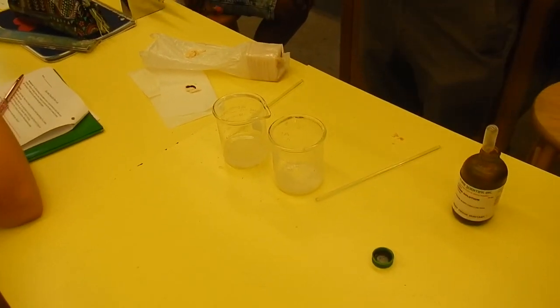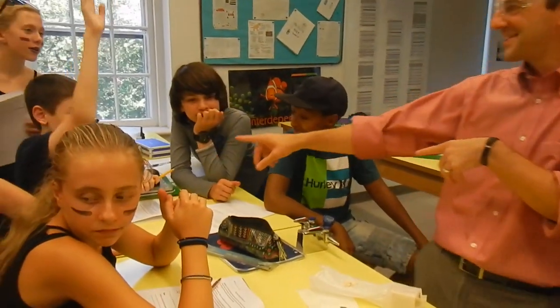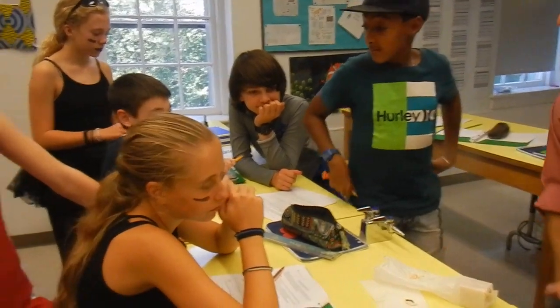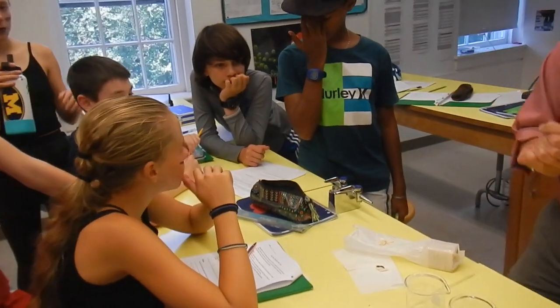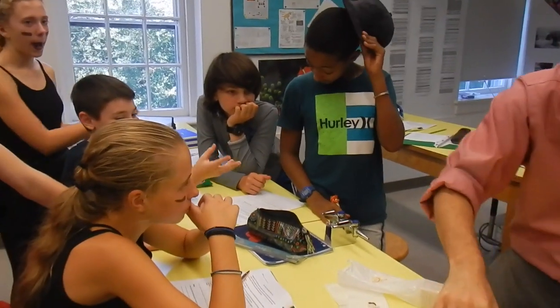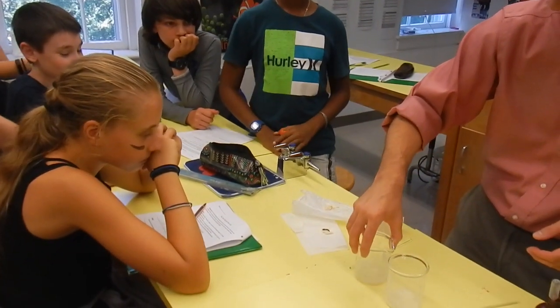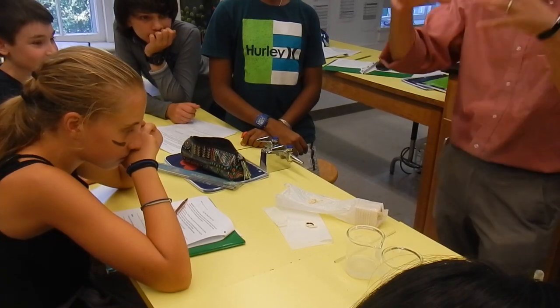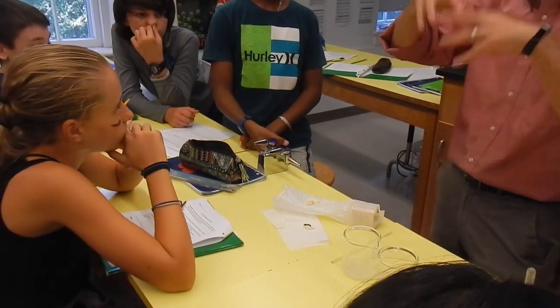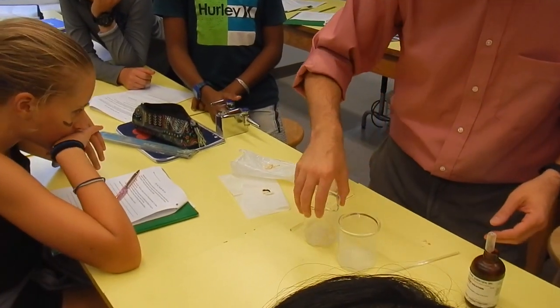So first of all, why did I have to break it into little bits? Because that's what my teeth do. Why do you think my teeth have to break it up? I'm gonna call Henry this time because you guys both had your hand up at the same time. So chemical digestion, like if it's broken up, then the chemicals can get all around the different food particles, and that helps to speed it up. If you just put a big chunk of saltine cracker in there, it would take like hours, if not days, because it would just do the carbohydrates on the outside and then have to work very slowly inside as it digests. All right, great.